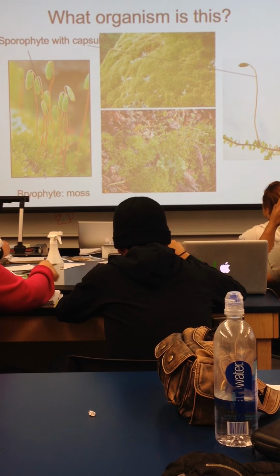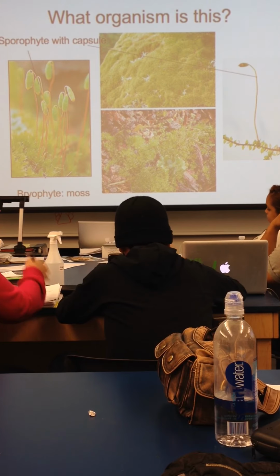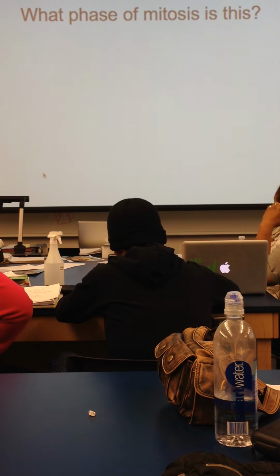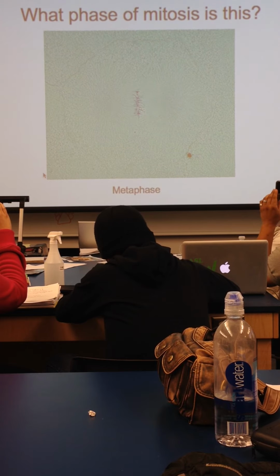All right, is everyone okay if I switch? Okay. What phase of mitosis is this? Metaphase. And how do we know it's metaphase?